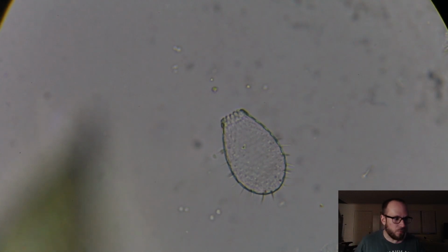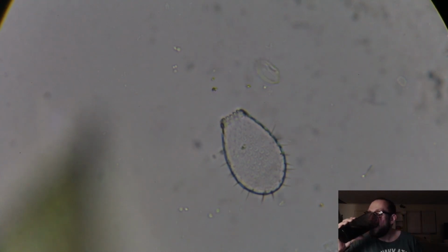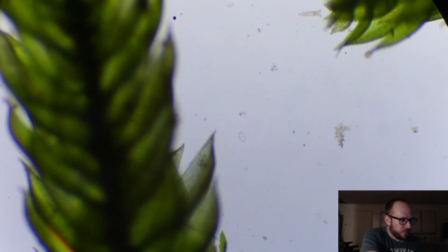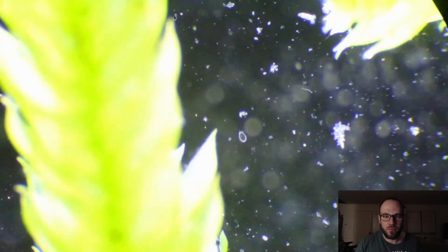It's... Yeah, you can see little bumps on it. Couldn't see that at lower magnifications. I think this shit's so friggin' cool. I think it's the coolest thing ever. I love just watching this microscopic stuff swim on this slide. And I'm practically a god to it all.